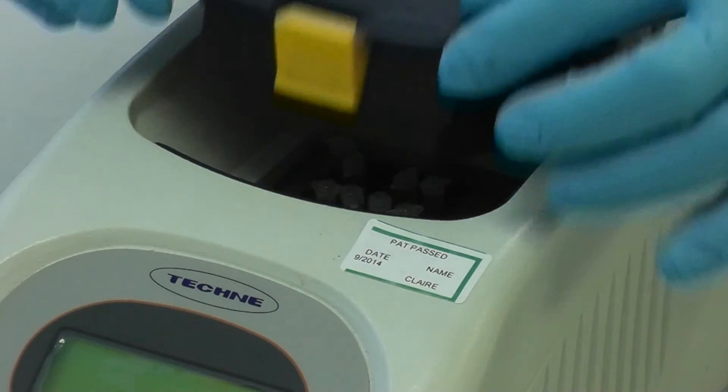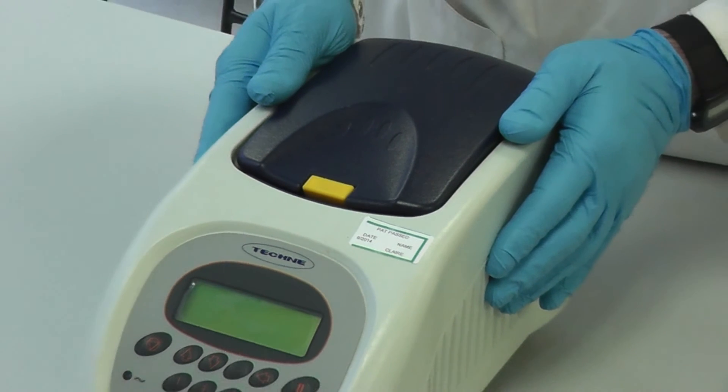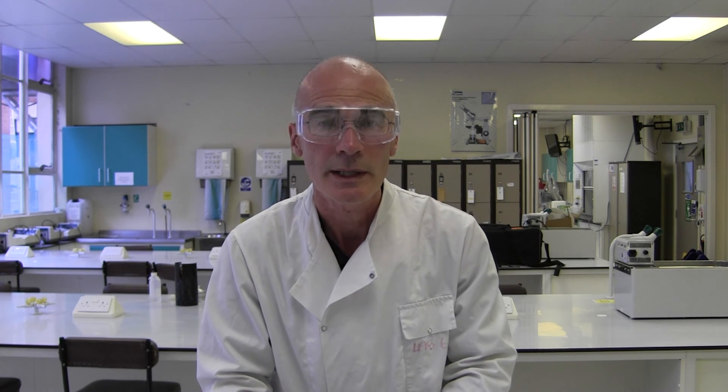Once we've loaded the samples, we switch the machine on to its pre-programmed cycles, and typically after about three hours and 30 cycles, the machine would stop and hold your samples at four degrees centigrade. Then at your leisure, perhaps later the same day or the next morning, you would take those samples and analyze them directly by agarose gel electrophoresis, where you would look directly and visually for amplified fragments. That then is the polymerase chain reaction.